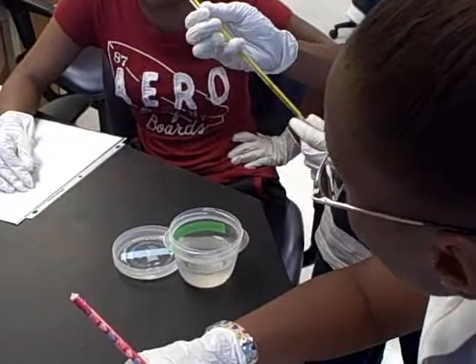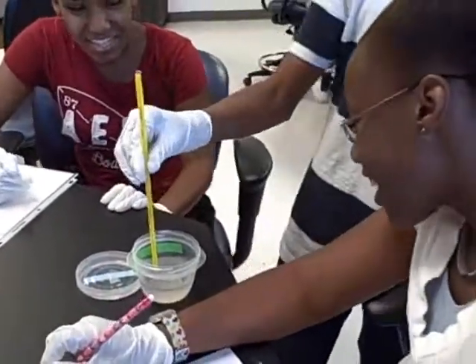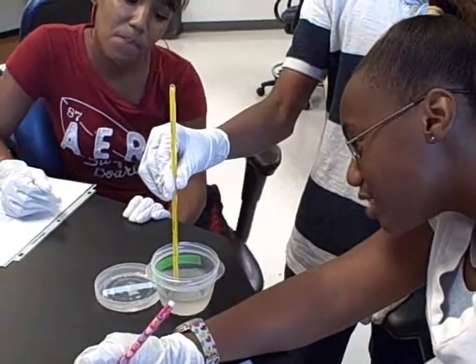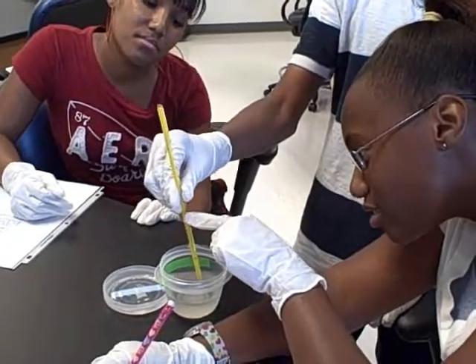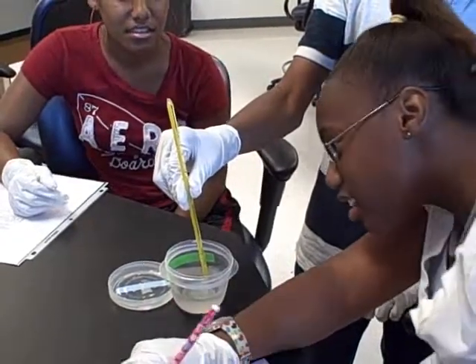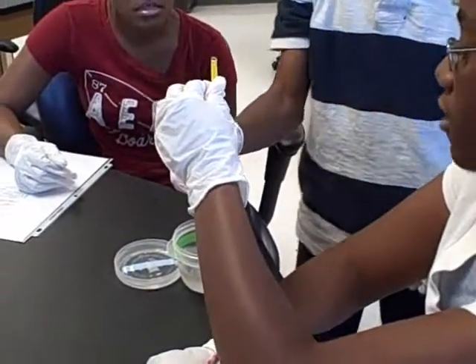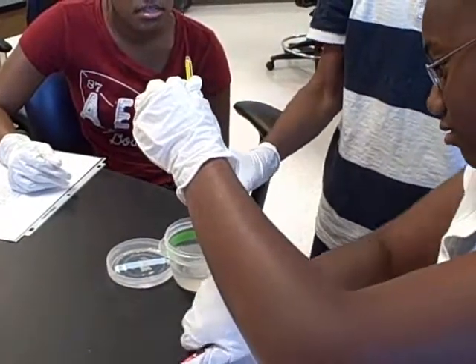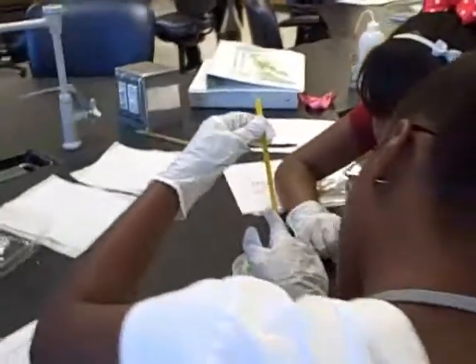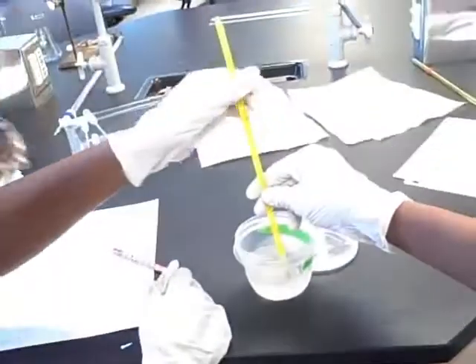What do you have on the nitrate? Is that what it says on the chart? Oh. Okay, cool. 0.5. What about nitrate? I mean pH. 7.5. What about hardness? Carbonate. It's interesting. I think it's right. And what about general hardness? The 20? Yeah. Okay. So the 200 is darker than before.